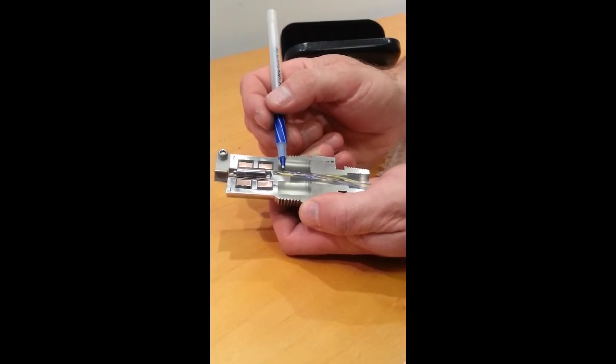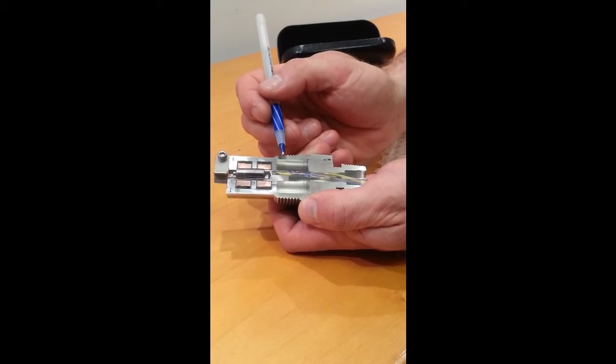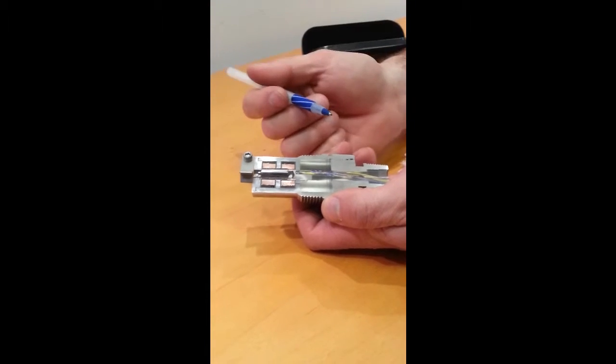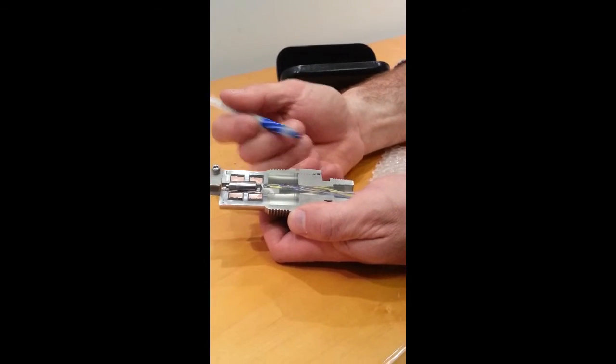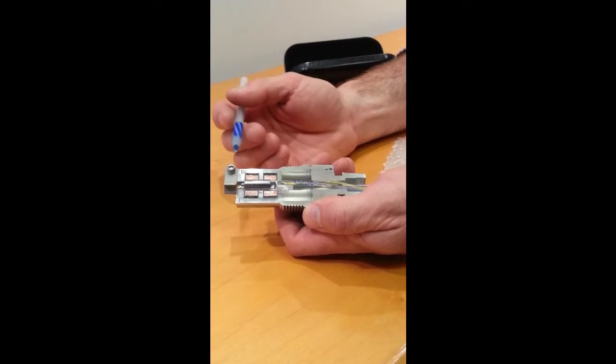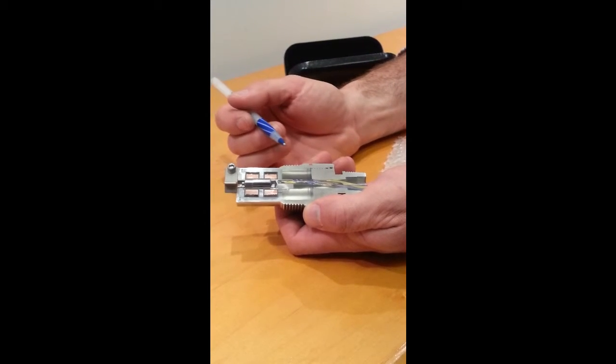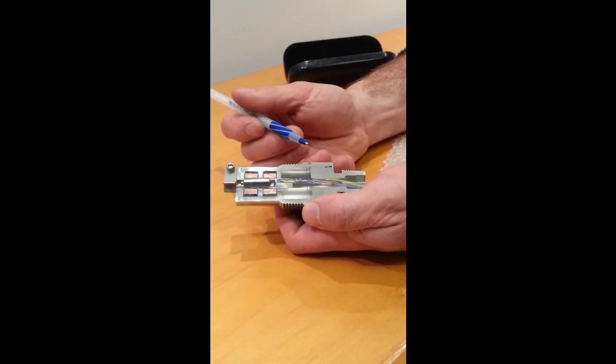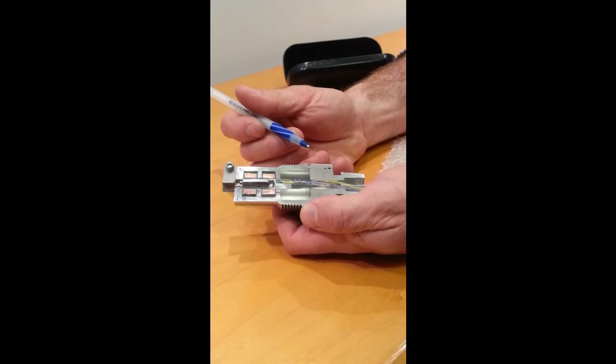The RTD is giving you temperature. So our system measures both viscosity and temperature. Back in our proprietary electronics, we go and we calculate the absolute viscosity based on the time of the piston travel. We give you the temperature in degrees C or degrees F, and then we also calculate temperature compensated viscosity based on the input that the users give.